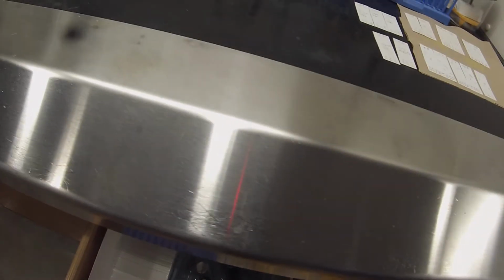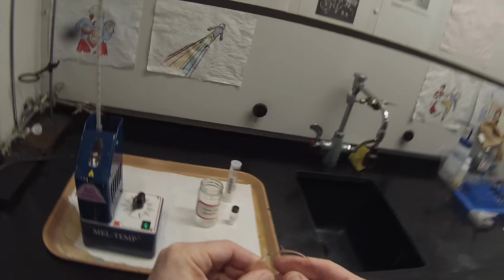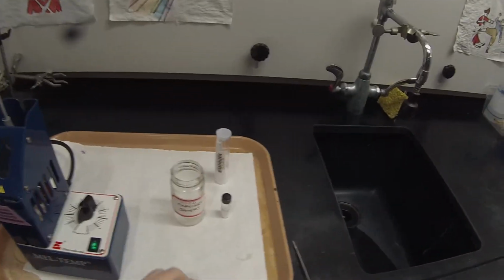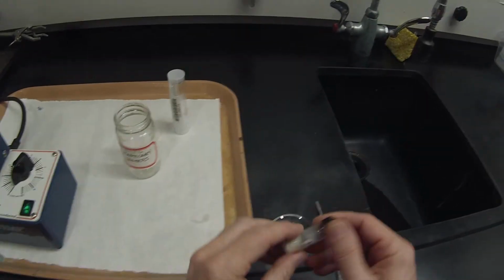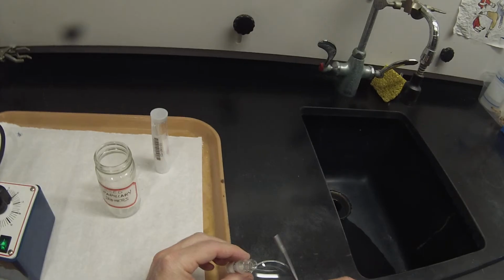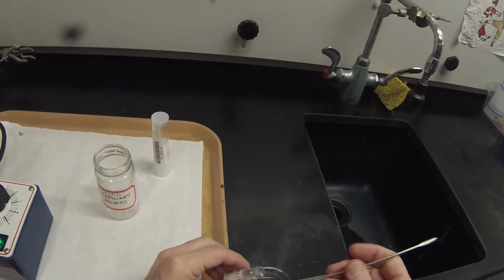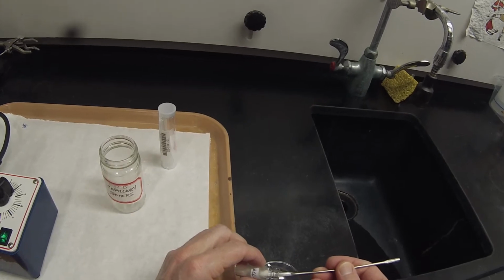It's always a good idea when you're running a melting point to take a little bit of that compound and put it on a watch glass so that you can make sure it's ground fine and you don't get any kind of large chunks in there. I'm just going to take a little bit of my solid out.